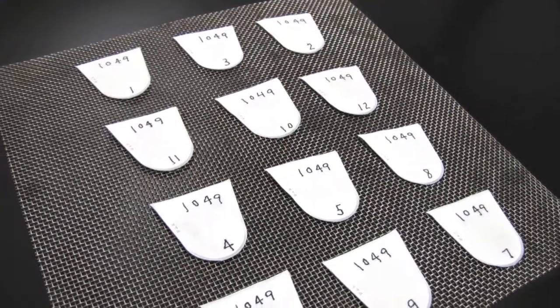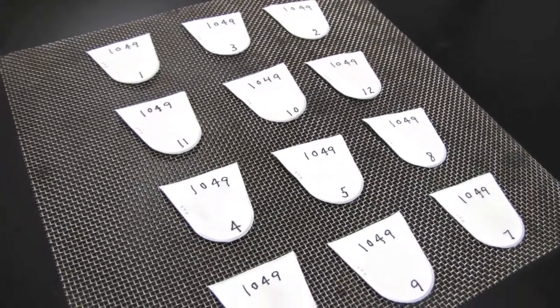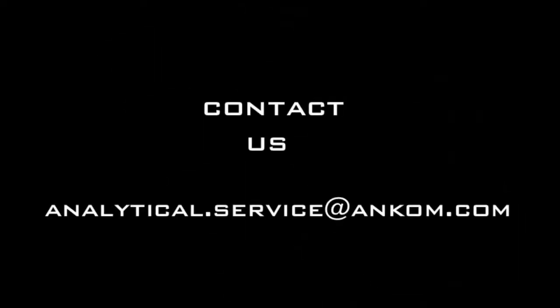The bag is now ready for the pre-extraction drying phase.